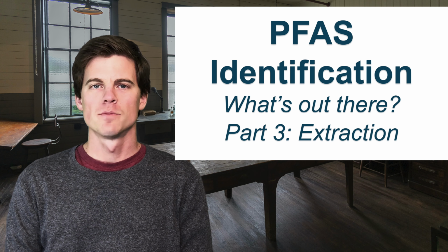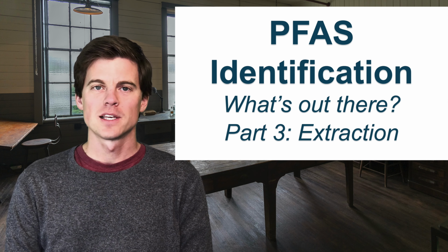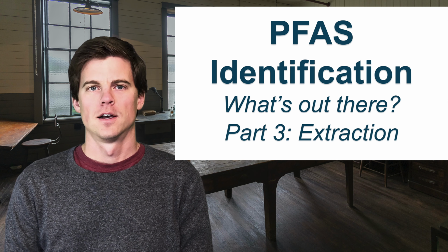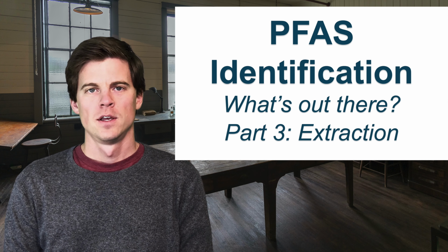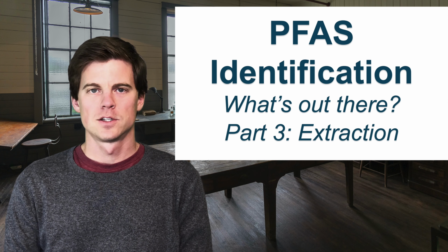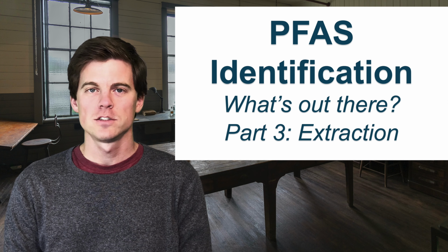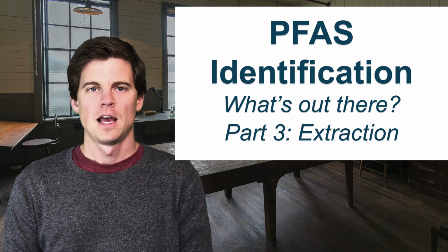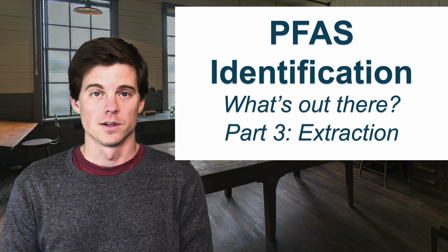This is a series more focused on the analytical chemistry of PFAS. If you're looking for more basic information, you can check out the series I did on PFAS background. But this is part 3. Parts 1 and 2 were about isotope ratios and mass defect. Part 3 today is going to be about extraction, so how you get PFAS out of an environmental sample and into a sample that you can analyze on an instrument.